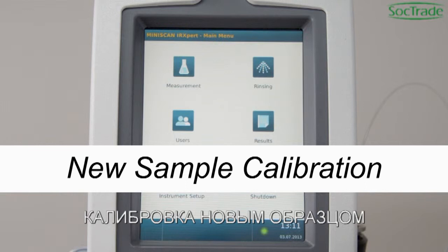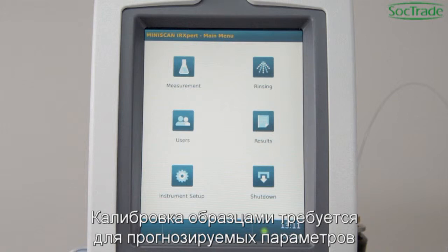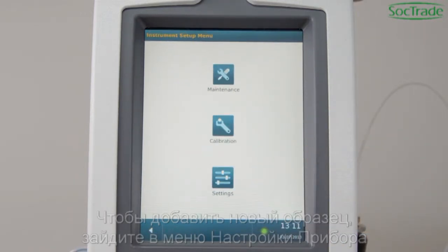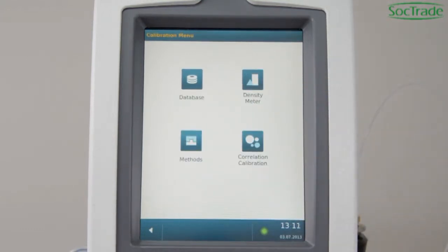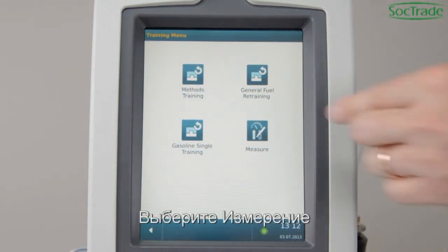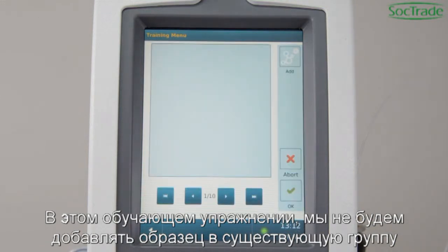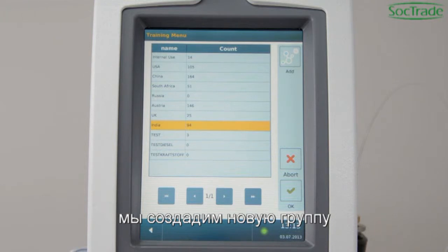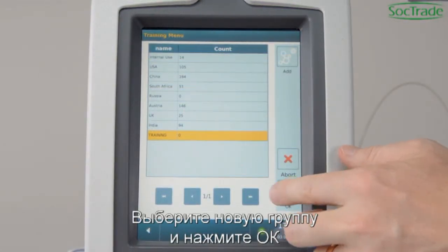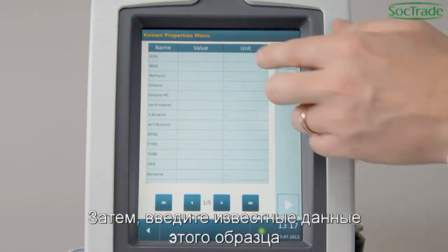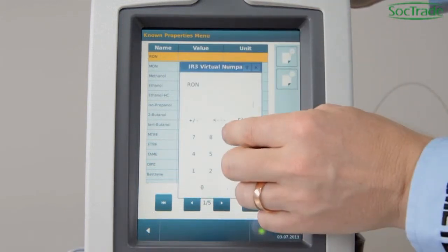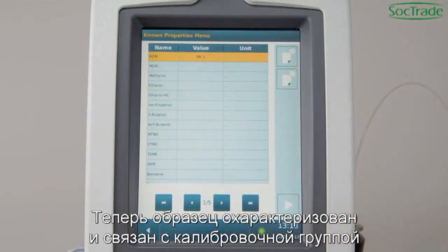New Sample Calibration. Calibration samples are required for the prediction of fuel parameters that cannot be measured directly. To add new calibration samples, go to Instrument Setup, Calibration, Correlation Calibration. Select the fuel type and select Measure. In this training exercise, we will create a new group. Press Add and enter the name of the group. Select the new group and press OK. Then add the known properties for this sample. Always select a unit field for any property. Now the new sample is characterized and assigned to a calibration group.